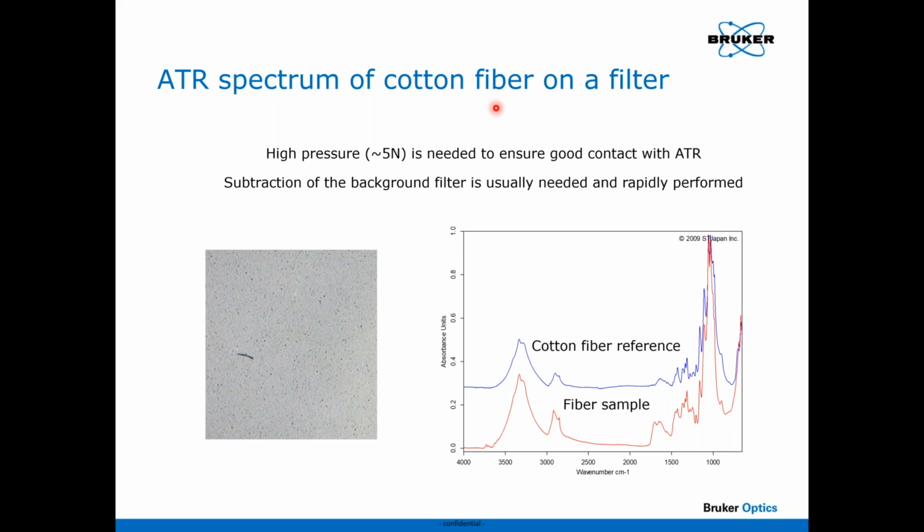Well, when you look at fibers that should not be around, how do you analyze those? There are a lot of ways to do it. My favorite is to use a membrane. The reason is these membranes like PVDF or nitrocellulose or any of these others actually work as kind of microscopic Velcro.